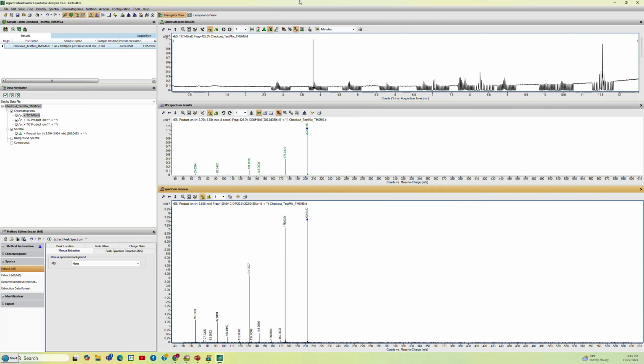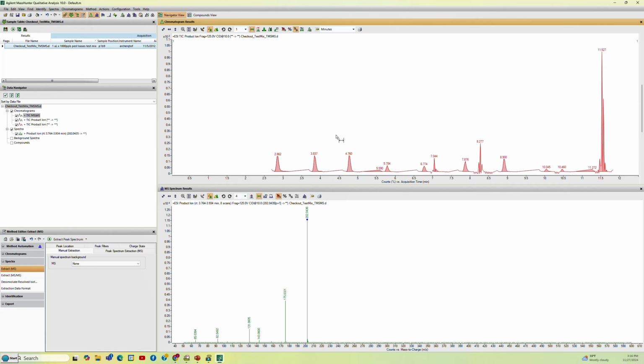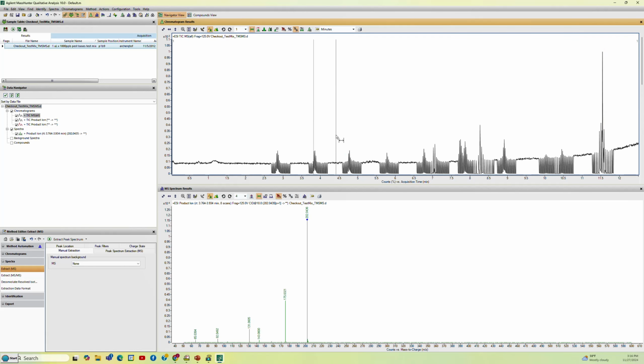And to get out of the walking man, it's best just to go up to this thing that says range select. That'll get rid of the walking man extra spectral pane, make it go away. And now you have the different displays still all available. So that's pretty much all I wanted to show you.